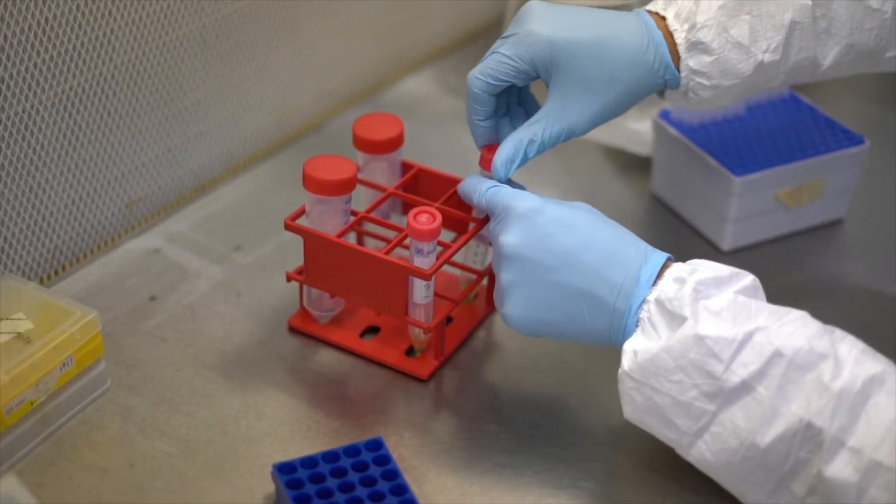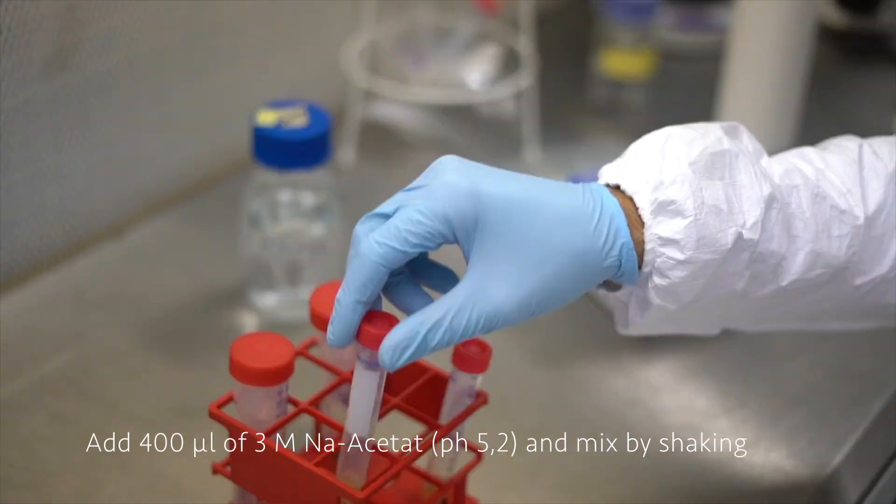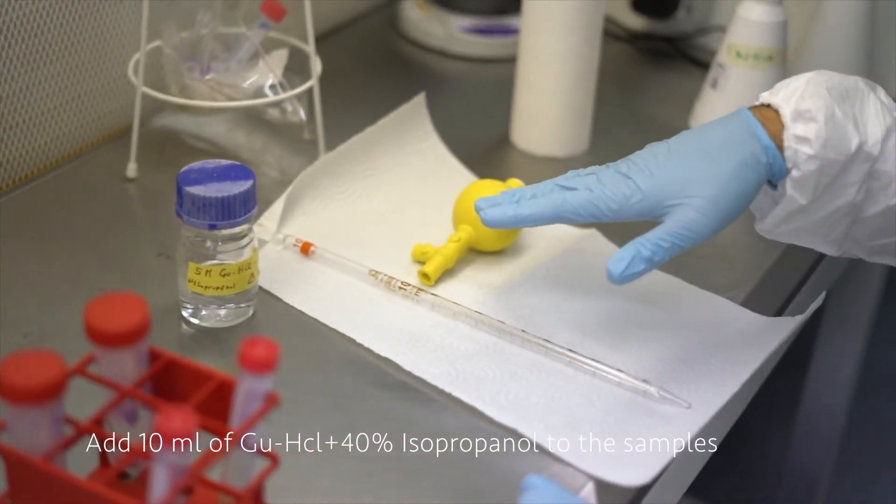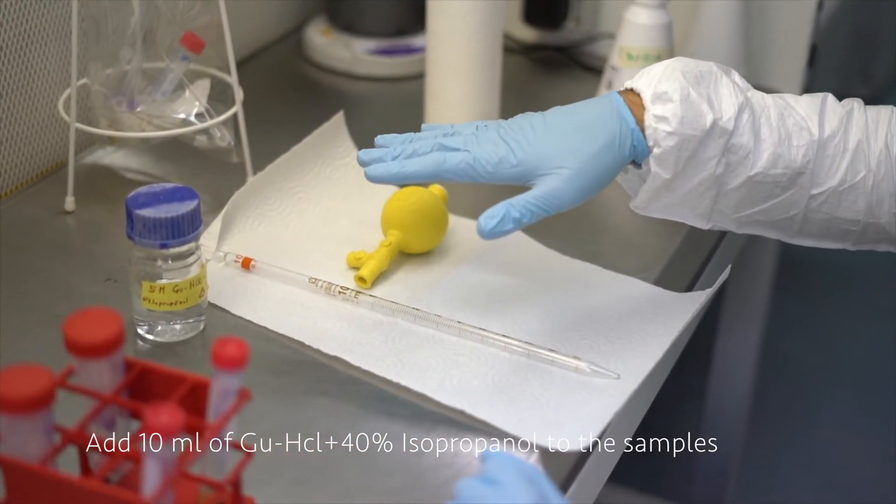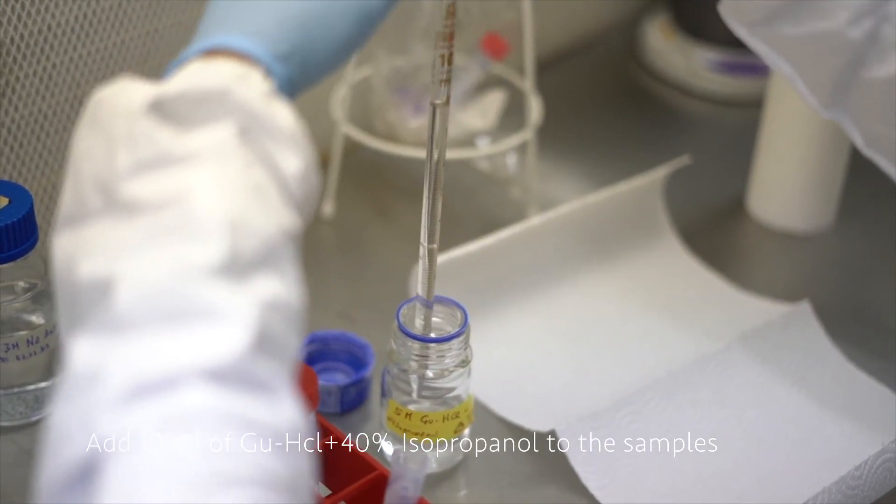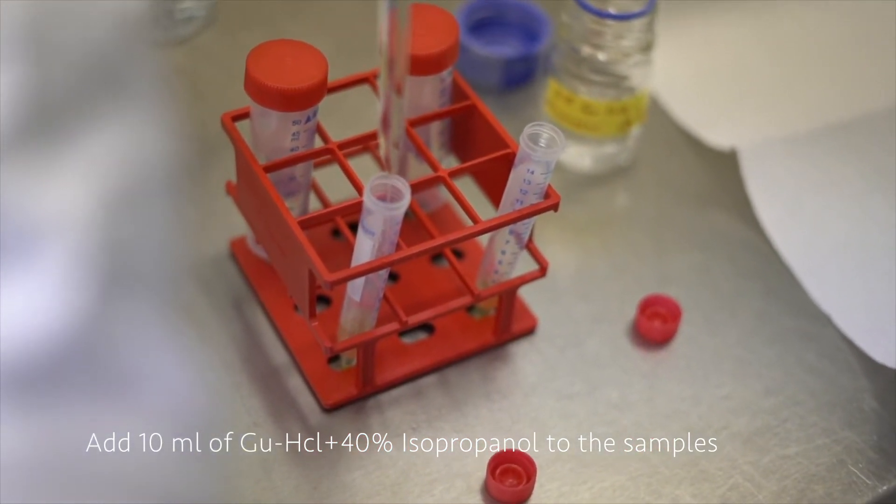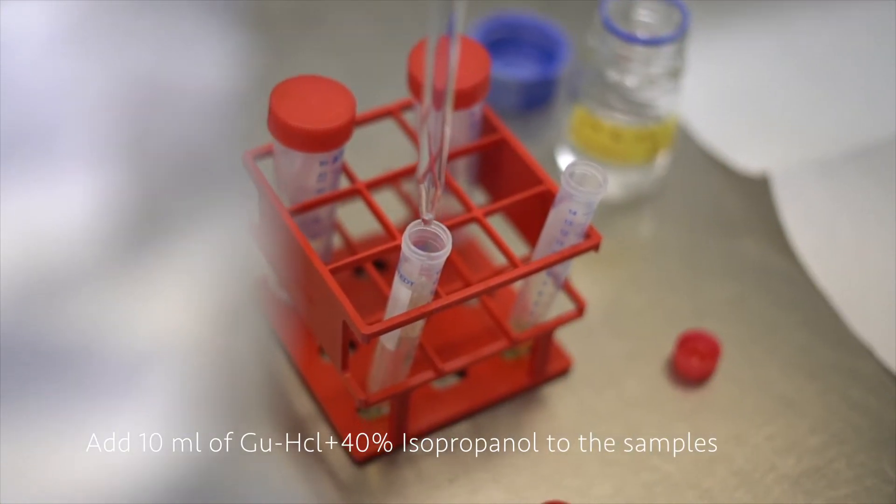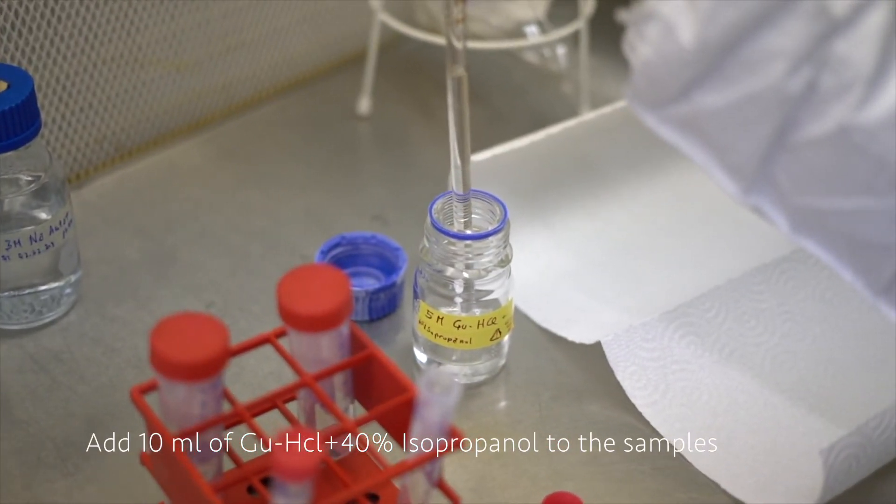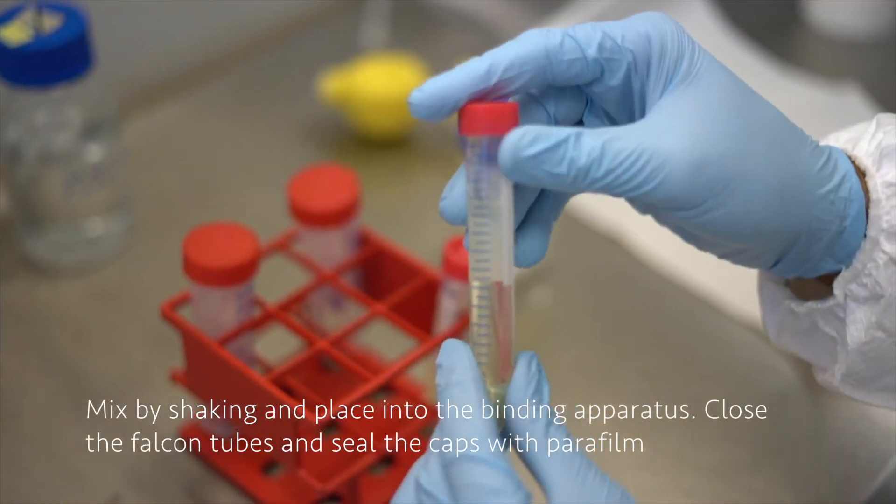Now we have to add 400 microliters of sodium acetate to the samples first, mix them shortly, and then add 10 milliliters of the binding buffer. For that I'm going to use the serological pipette. We need to add 10 milliliters, quite a big amount, and a pipette ball.